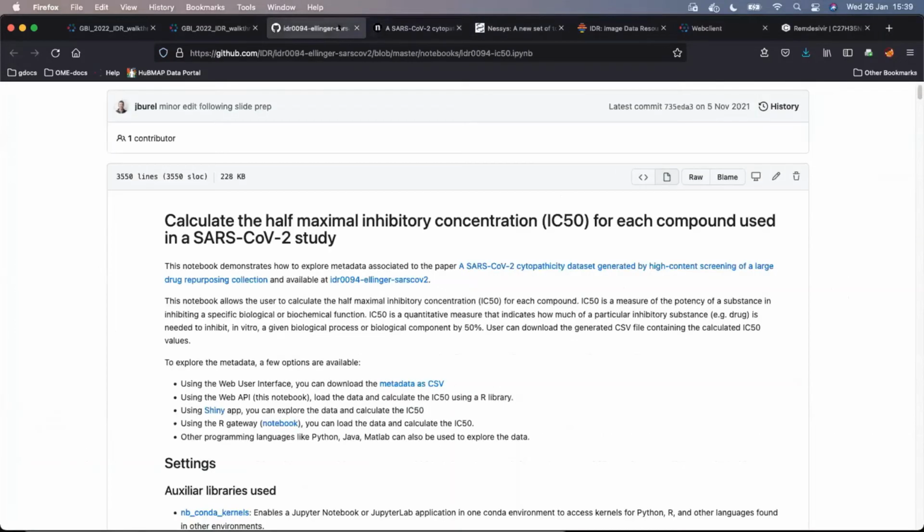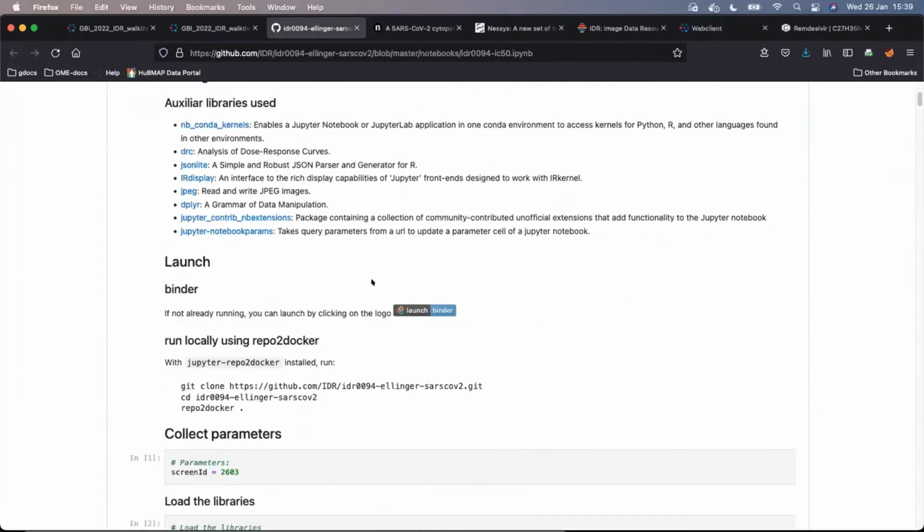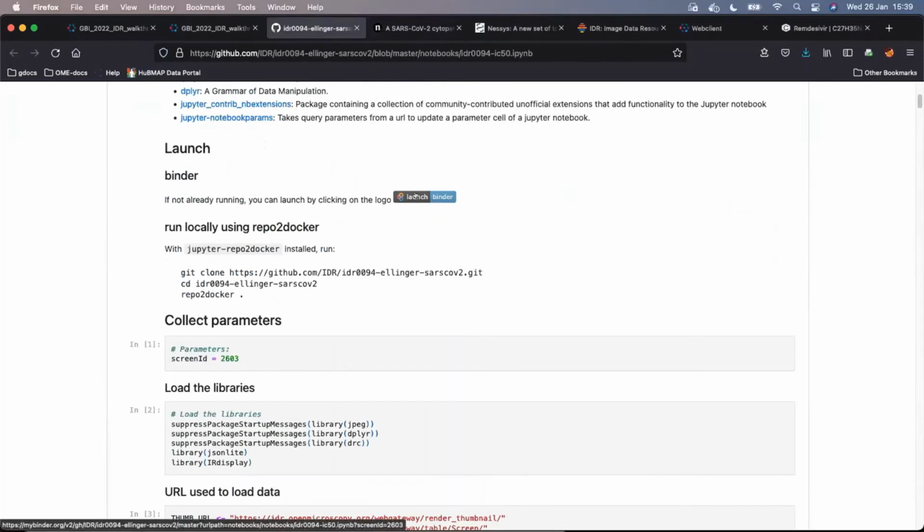Then you can basically explore by launching this badge. I will not do that. You are free to do that on your own time. As I said yesterday, the Binder service is a free service, but you have to pay with your time and patience. It's usually quite fast. I definitely don't want to say that it's somehow bad, but if we all click on that now, we can have quite a wait.